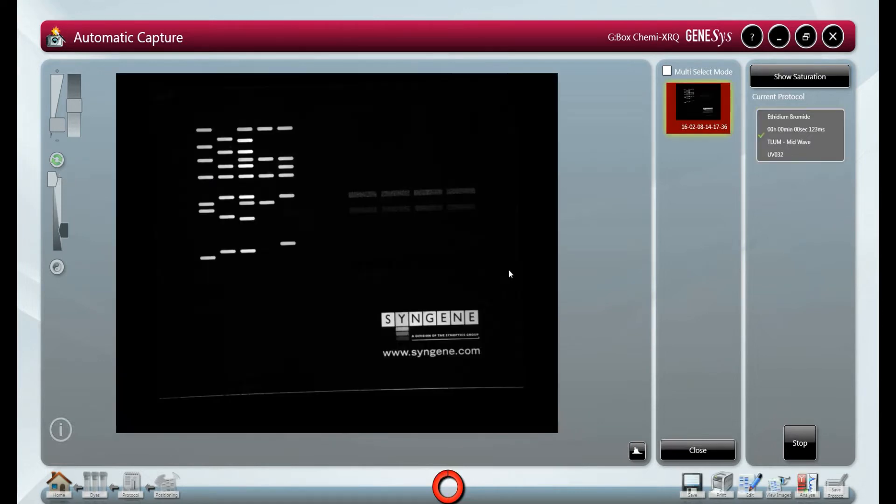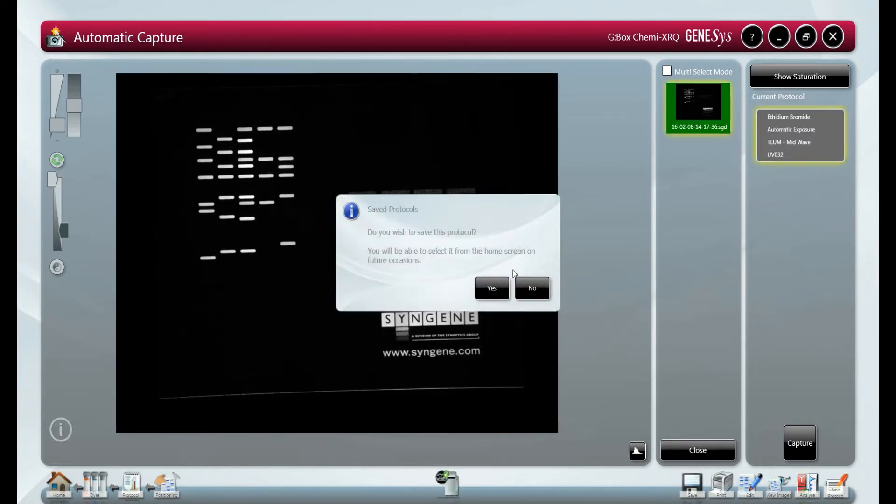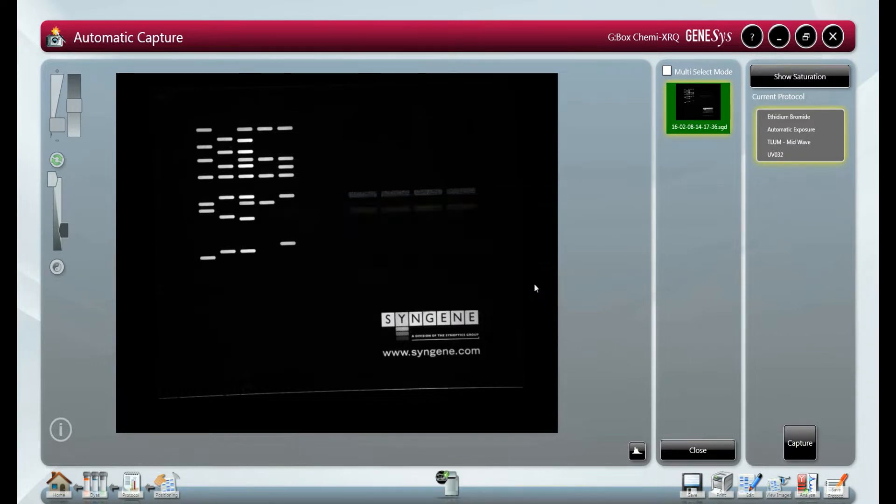We can then save this as a protocol, meaning all future gels can be imaged in the same way. This means we can skip the image setup and go straight to the sample positioning.